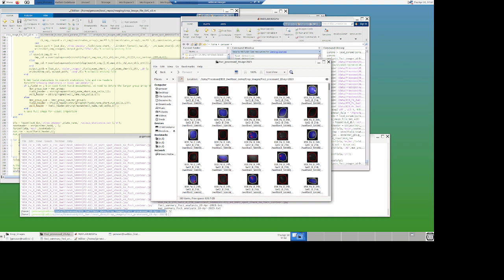You can see how it's not picking any of this crap here. None here too. So maybe I have a very stringent detection. But here on the other hand, you can see how it got these spots. Here, nothing. Here, you got 2 spots. So sometimes when people use my tools, they ask, why did it pick that and why not? That's kind of like the magic of the wavelet. They tend to look at the K value, which is what makes a difference here. If it sees a spot that looks really nice, it will pick it up, even if it's not so bright.